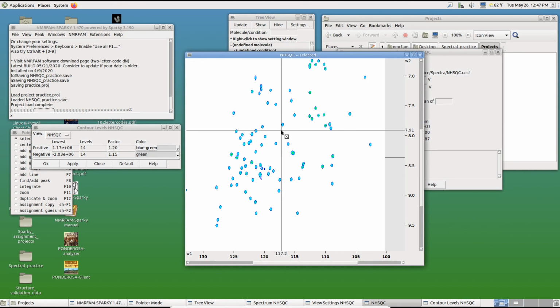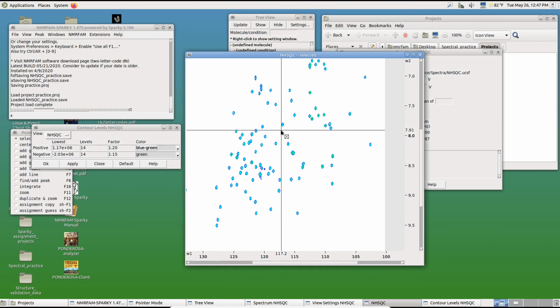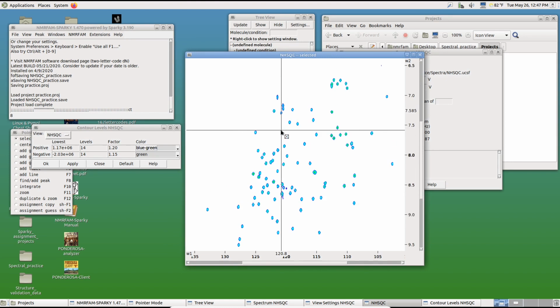You can just type XX again to get that back. You can do this as many times as you want until a preferred setup is accomplished.